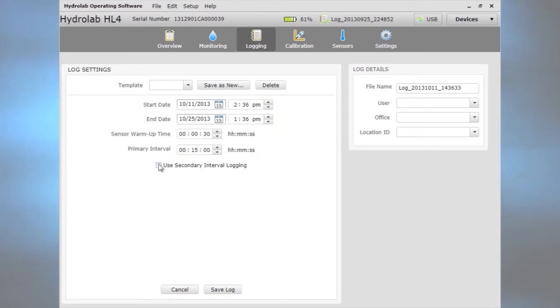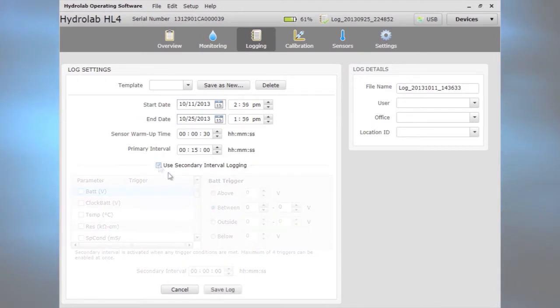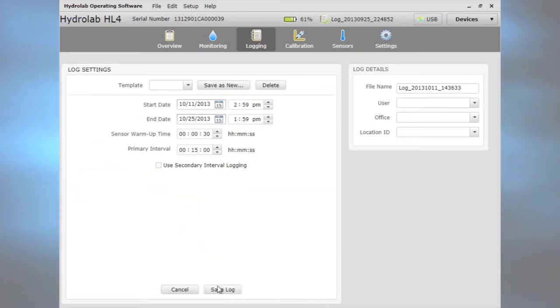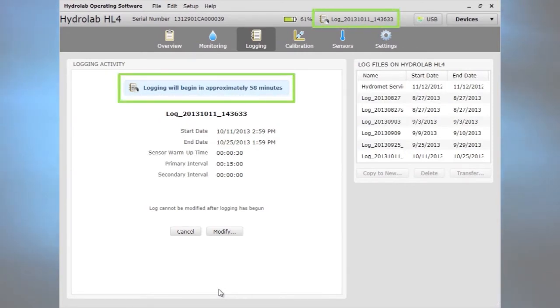The optional secondary interval allows faster log intervals when specified conditions exist. Logging begins automatically at the start time and all available parameters are logged. There are visual icons that tell when a log will start and when a log is on.